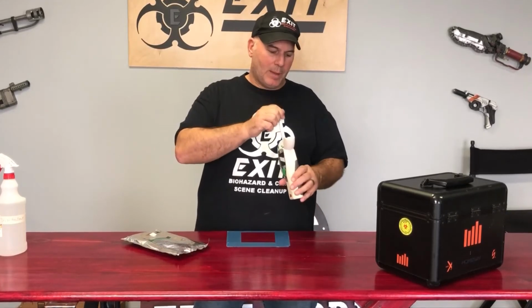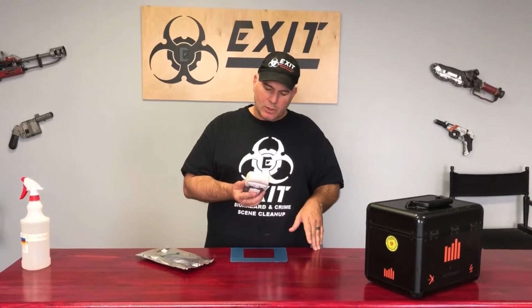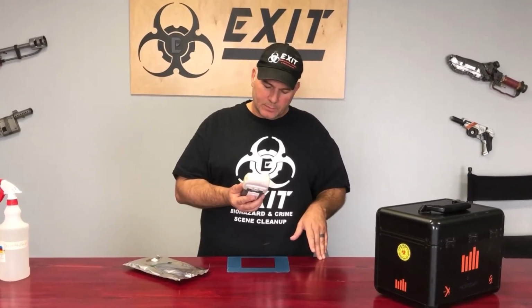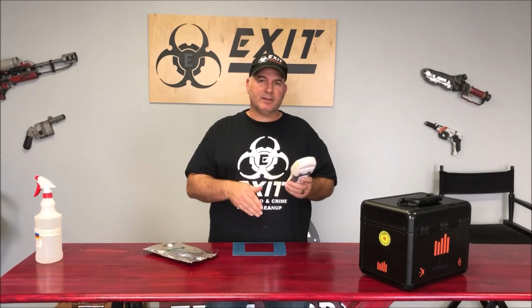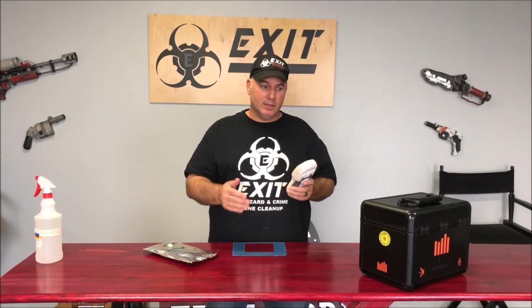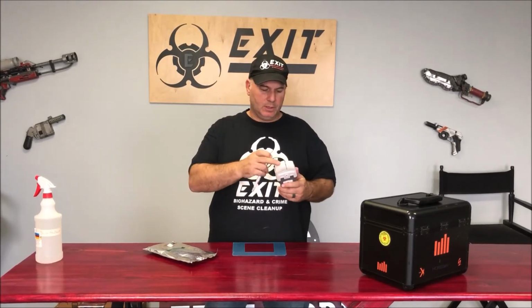We're gonna pop it in the machine. This just said we have 1,250 RLU. So that's a pretty high number. That is a fail, okay? So we're gonna try disinfectant, and then what we'll do is we'll come back and check that area and make sure it's better. Let's pop this one out. And now this goes in the trash, okay?